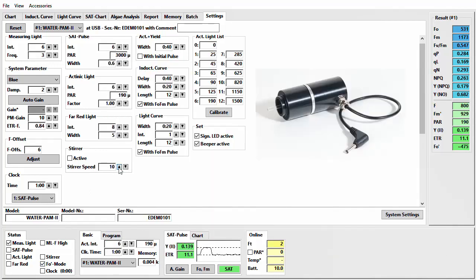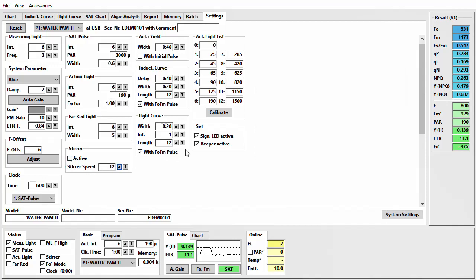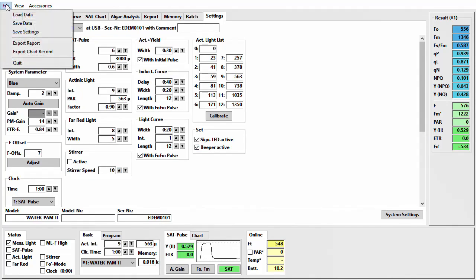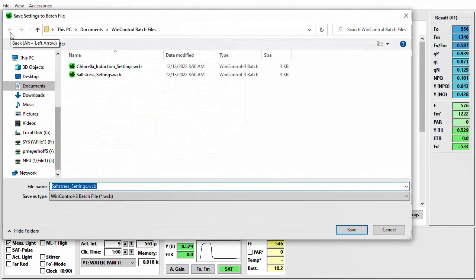If you have the optional Water 2S Stirrer plugged to your instrument, you can control stirring and stirring speed here. The last field is Set — these are instrumental settings such as switches for the device status LED and the WaterPump 2 Beeper which confirms the execution of a measurement. All settings can be stored for later use as a batch file in the File menu using the Save Settings command.